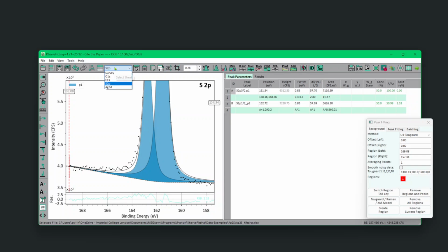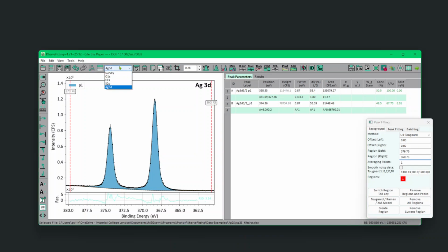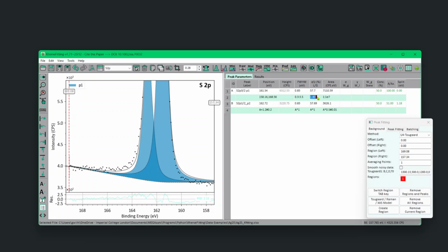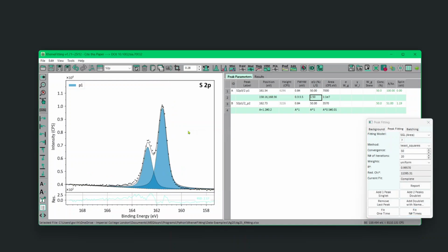We found on silver that this was 53. So they will again tend to have similar peak shape. So maybe we'll go around 50% and fit again. Okay. Then now zoom out. So what we can see is we can't fit it with one. There are actually two sulfur.